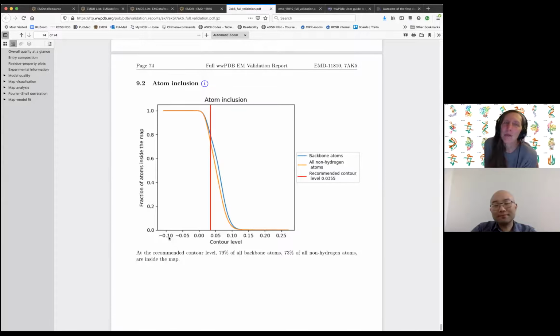So, that was one of the first standardization issues that we had to deal with when we were working to create a joint map model deposition system. So this is an improvement, that almost everybody has their model and their map. You would think that that's nothing, but are there any other questions?